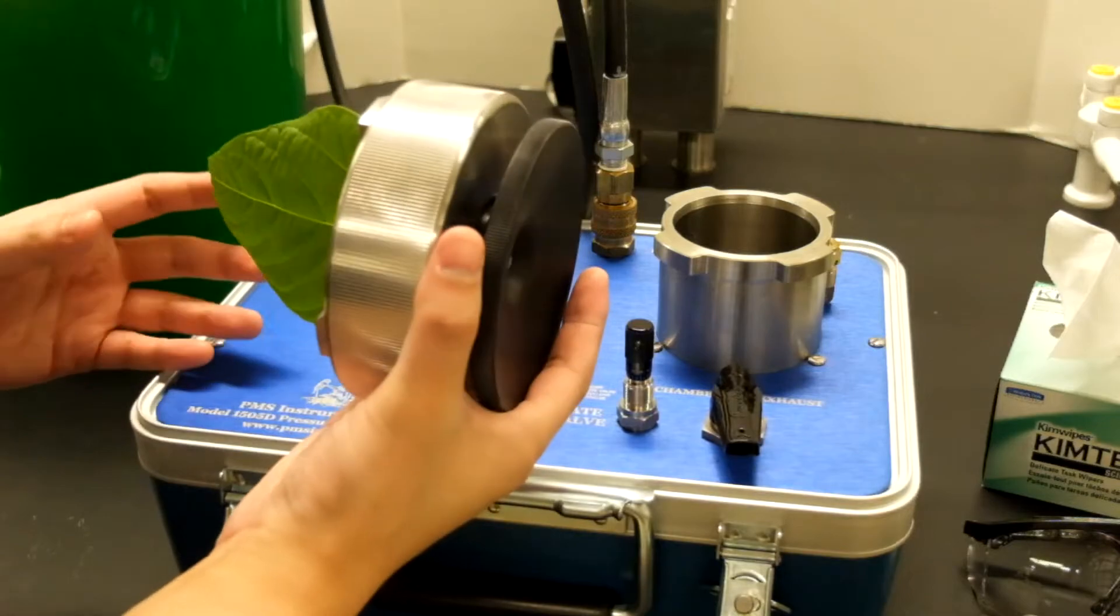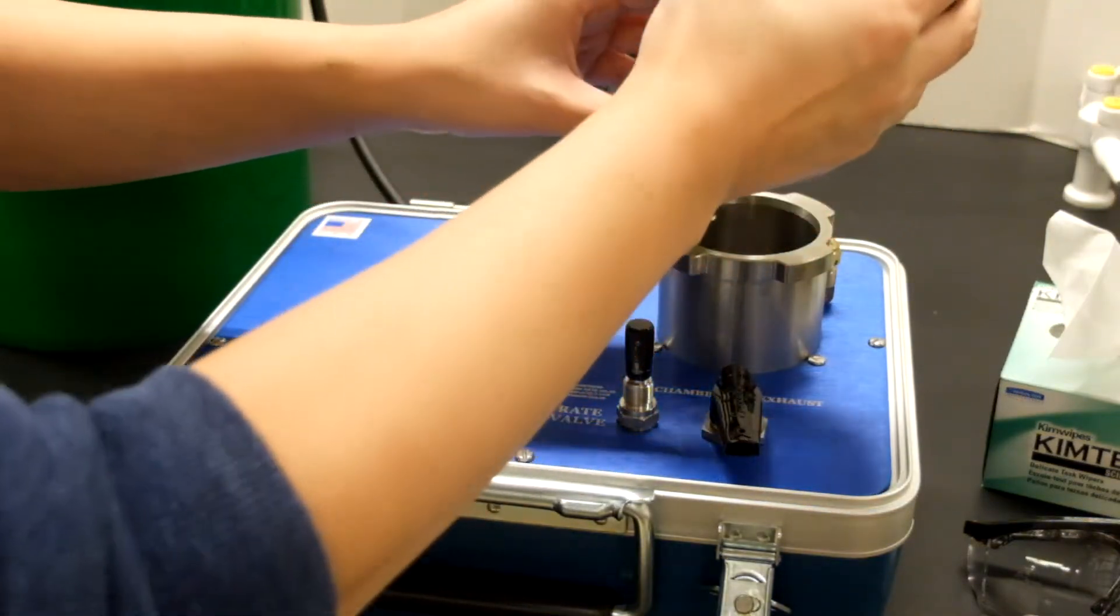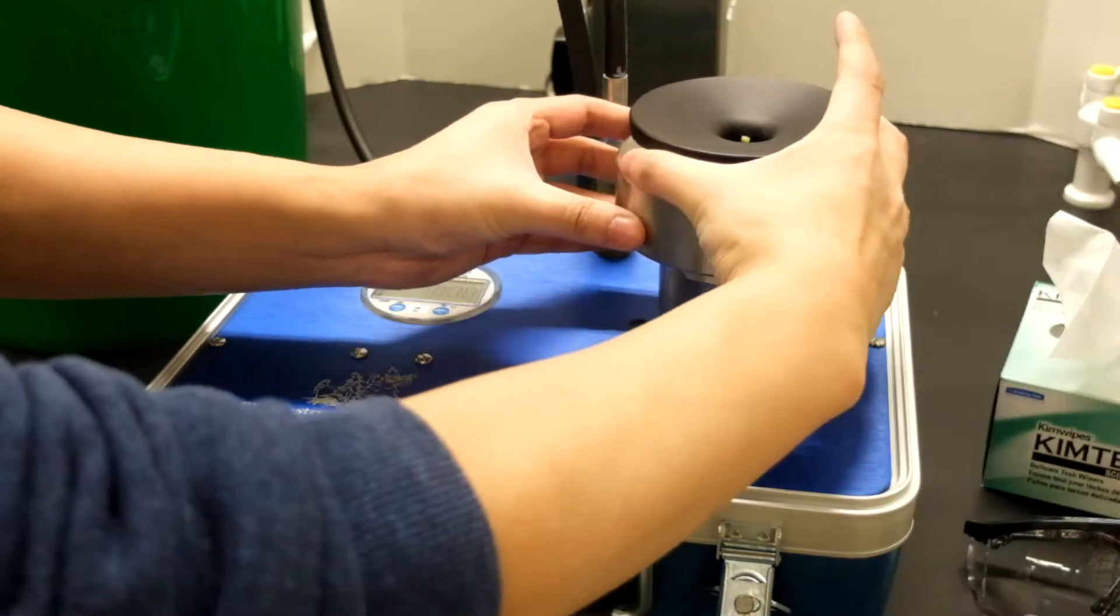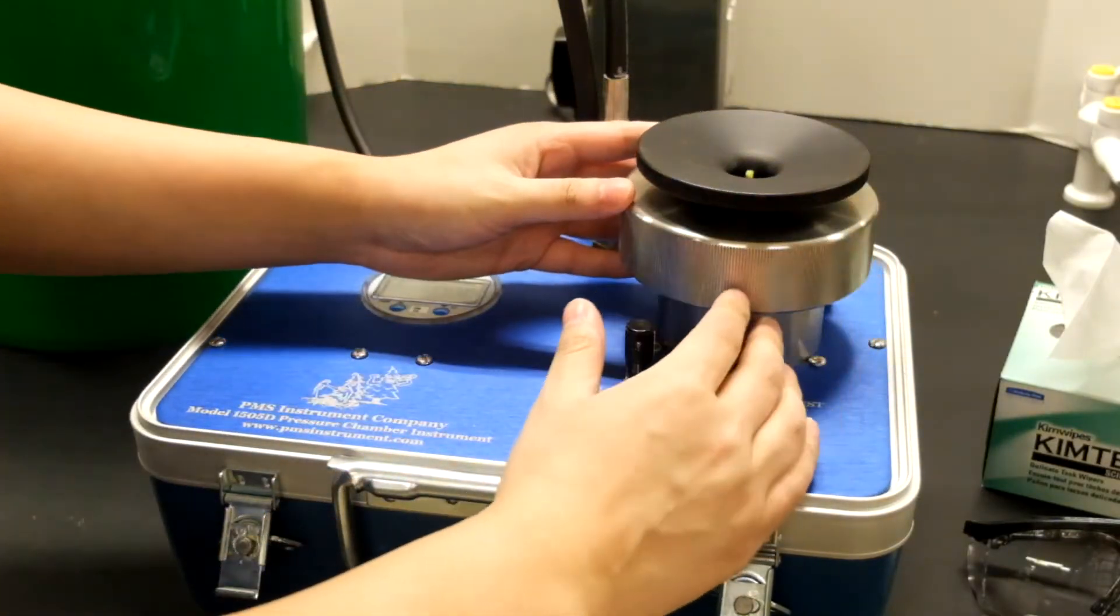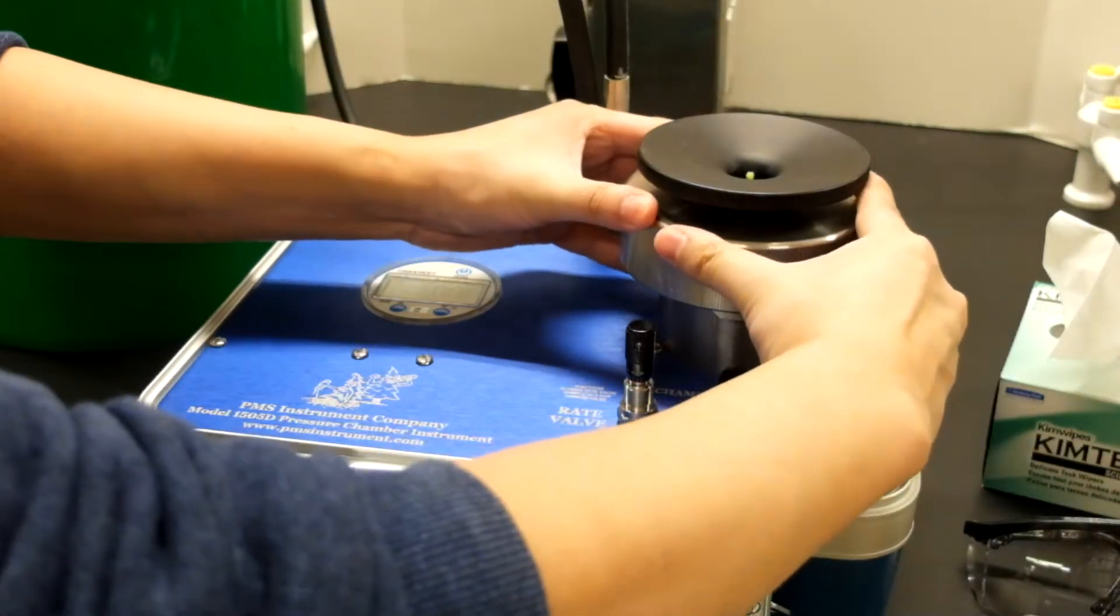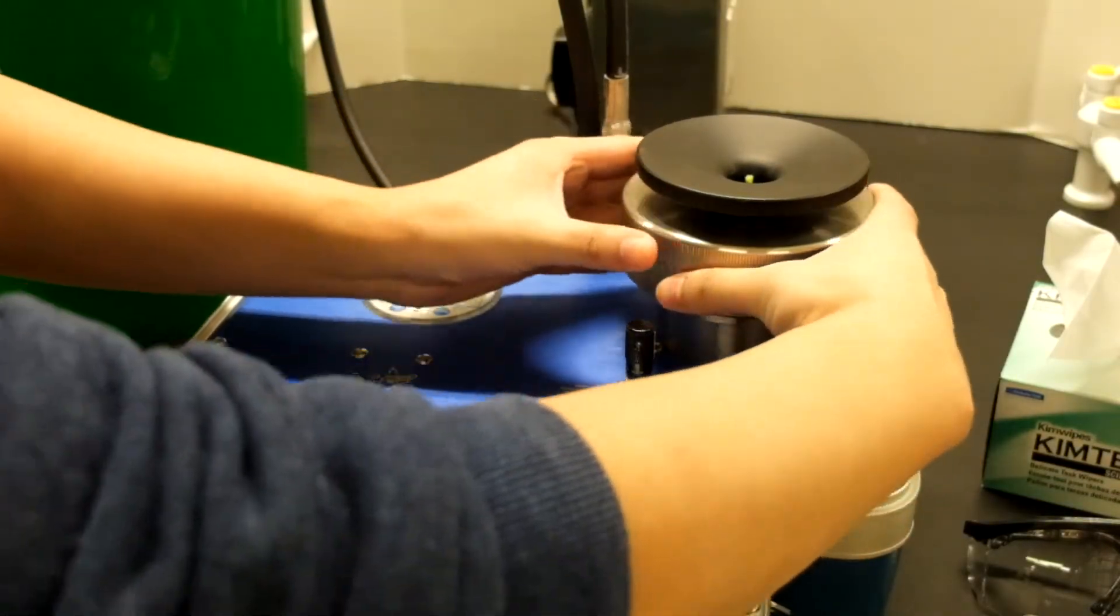With our leaf secured in the gasket we can then put the leaf inside the chamber. The gasket will fit on top. To secure the gasket we will press down on the metal lid and turn clockwise.